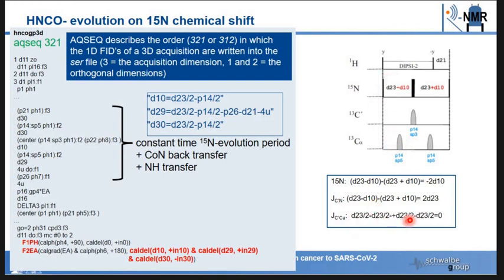And if we do this calculation, following these pulses, this pulse and this, then we would see that this doesn't evolve at all. And this is exactly what we want to do. And we can look at it like this. But if you want to go more into detail, I can explain this very detailed, but I'm not sure that this is your focus. So I would rather go forward. I just want to tell you that you can do this, and that this is possible.